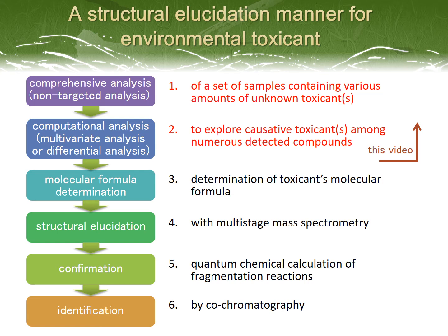First, a comprehensive analysis, so-called non-targeted analysis, is going to be performed on a set of samples containing various amounts of unknown toxicants. Second, computational analysis, like multivariate analysis or differential analysis, is going to be conducted to explore causative toxicants among numerous detected compounds.